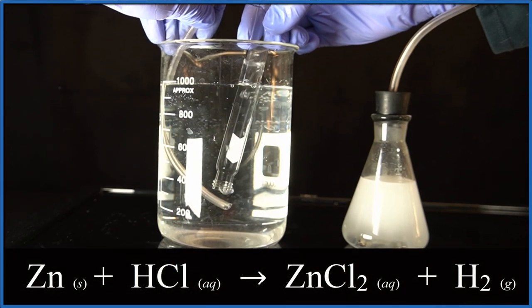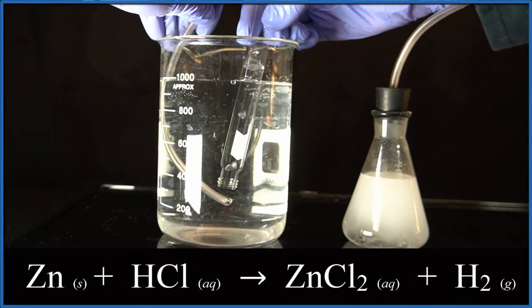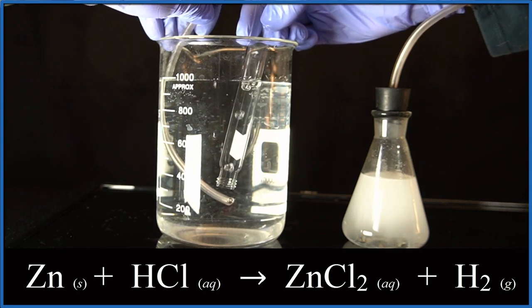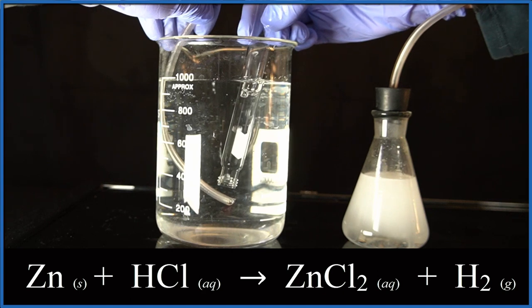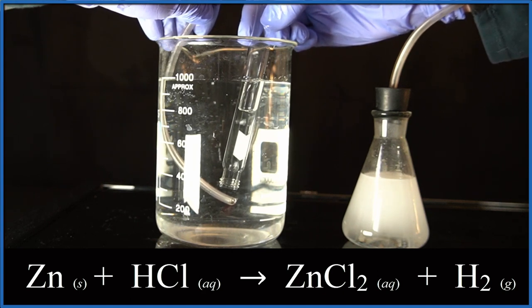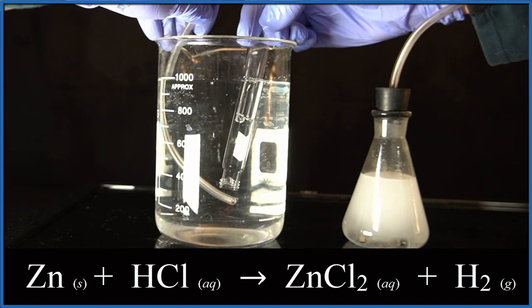So back to our equation, the zinc metal actually replaced the hydrogen in HCl in a single displacement reaction. We end up with zinc chloride, that's still dissolved in the water, and the hydrogen gas bubbles out. And that's the reaction of zinc metal with hydrochloric acid.